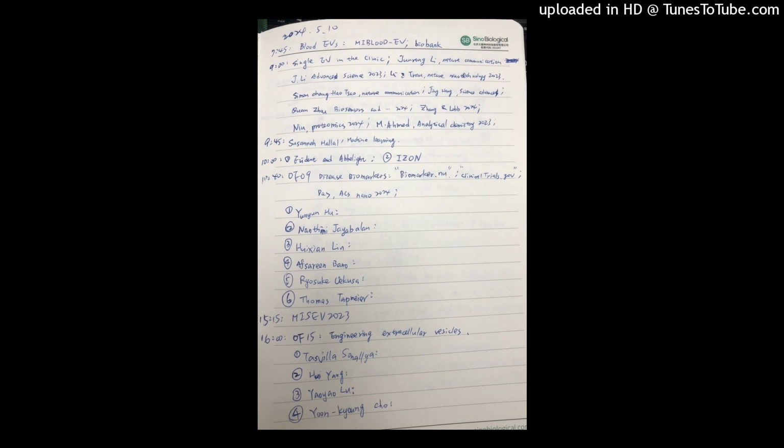Now, every biobank has their sort of standalone system. It's like a single center study. You cannot exchange the samples between biobanks because the quality and the consistency of these samples is completely different. But by knowing, for example, the platelet concentration, if that's relevant for your downstream application, whatever it is, then you can say, I will combine samples from different biobanks.